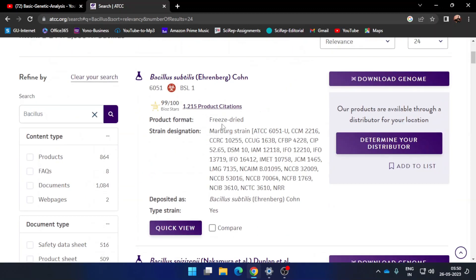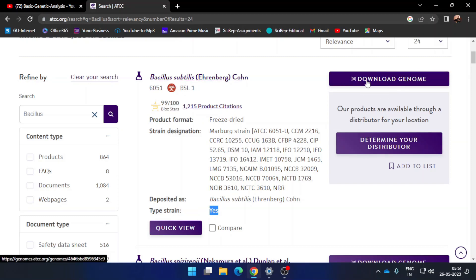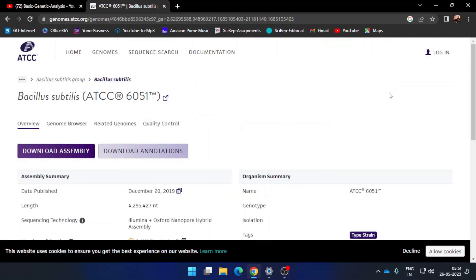The main criteria here is that you need to check the field that says 'type strain.' It has to say yes. For example, this entry for Bacillus subtilis — when it says type strain yes — means I can retrieve the 16S rRNA gene sequence of this bacterium. Adjacent to this entry on the right-hand side you will see a button called 'Download Genome,' so press that.